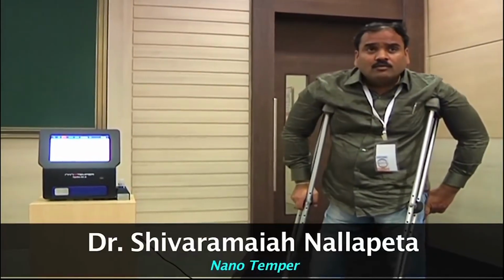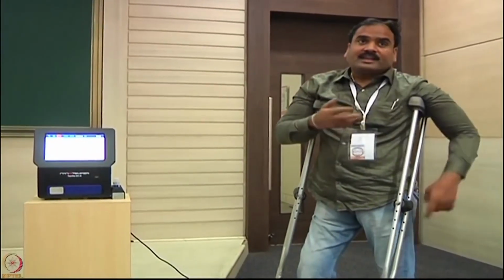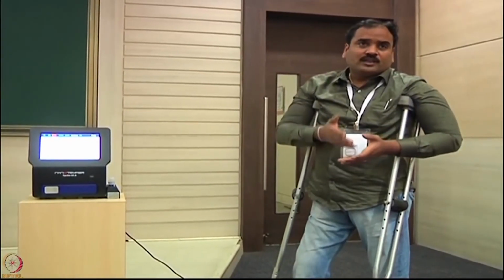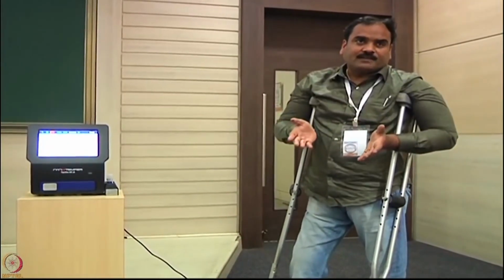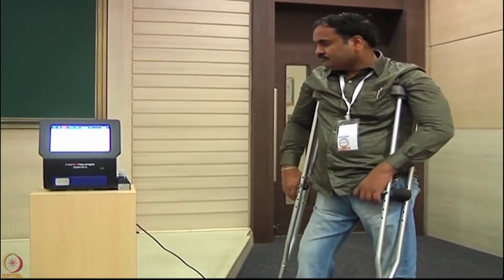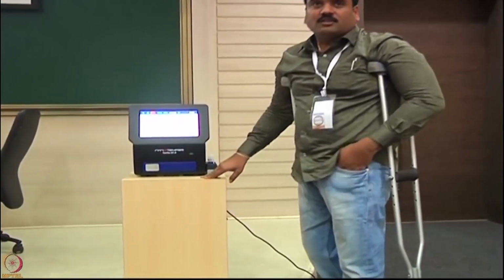Yeah, absolutely. And you can see multiple TMs in the same protein. The same protein can have multiple domains which are exposed at different temperatures. Particularly with mAbs, you get the Fab region and the Fc region at different temperatures. So even if your same protein is having multiple TMs, you can still get the data. So this is the biggest demo that we can do, and this is how you get the typical results.